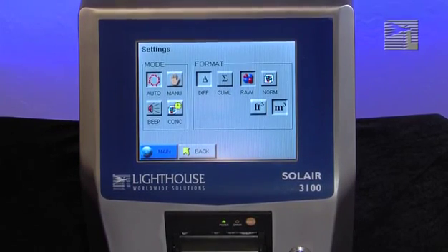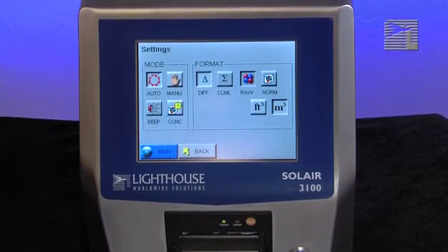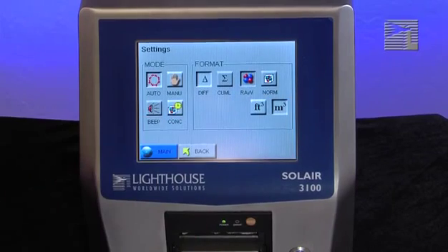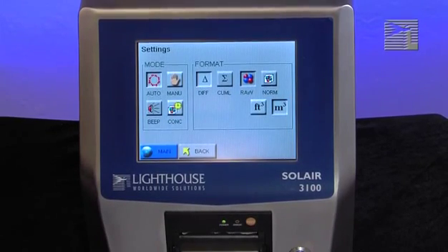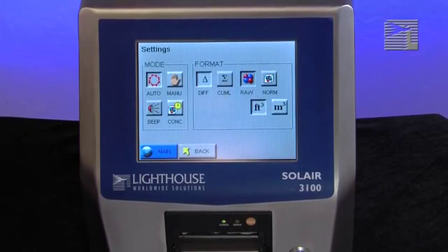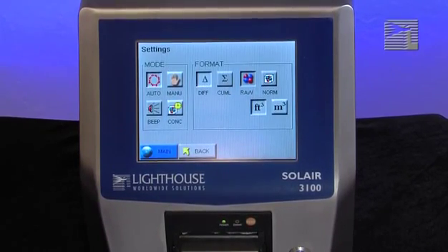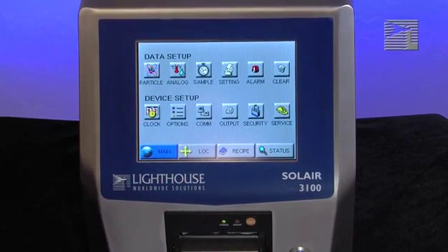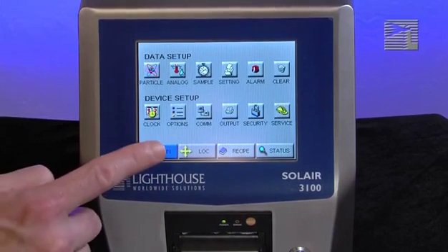The final selection you will need to make is to choose whether you want the data to show up as particles per cubic foot or per cubic meter. Select how you want the data to be displayed on the main screen. You have now completed your selection options in the settings section. Now press the back button to return to the configuration screen, or press the main button to return to the main screen.